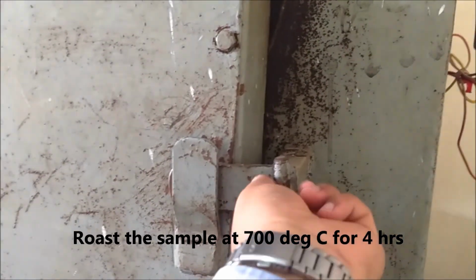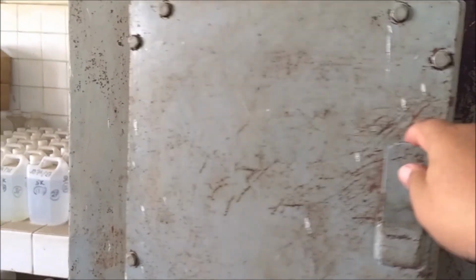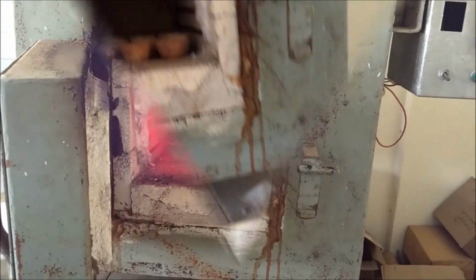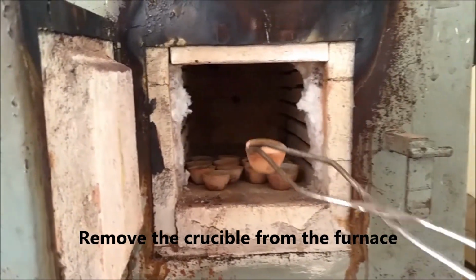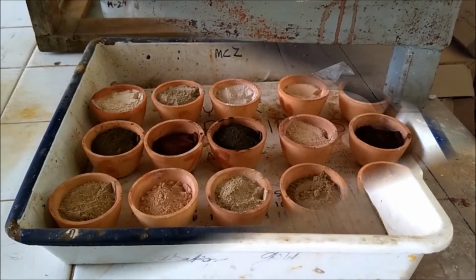Roasting can be enhanced by addition of some oxidizing agent like KNO3, and this is how the furnace looks at 700 degrees Celsius. After roasting, allow the crucible to cool, then on the next day remove the crucible from the furnace and keep in the position as you have placed.